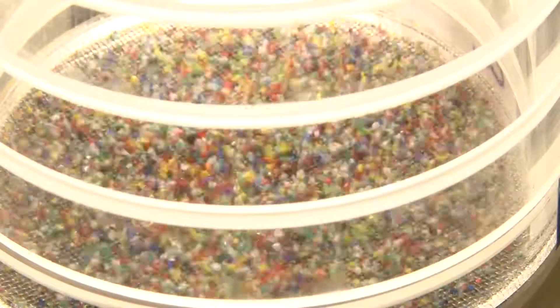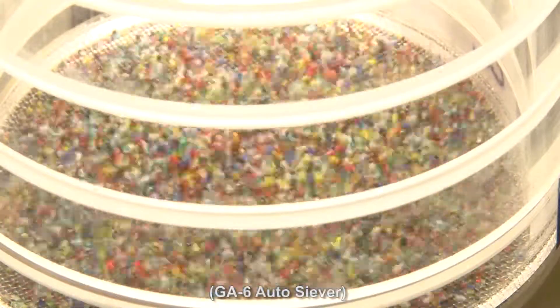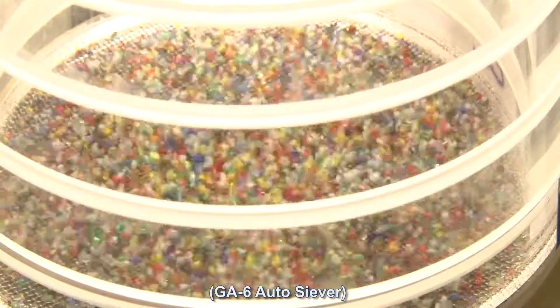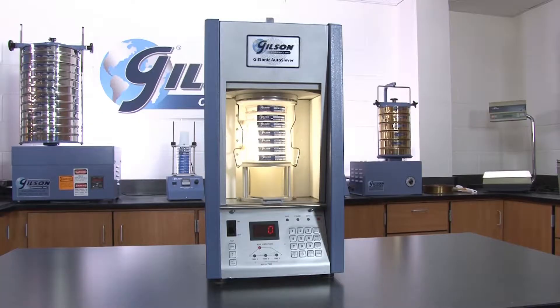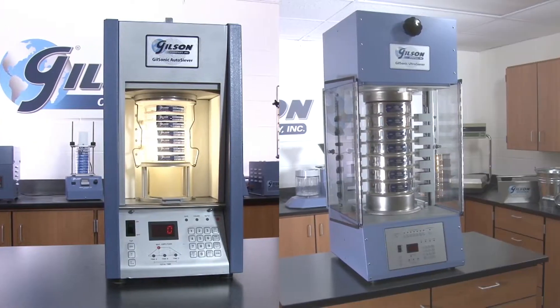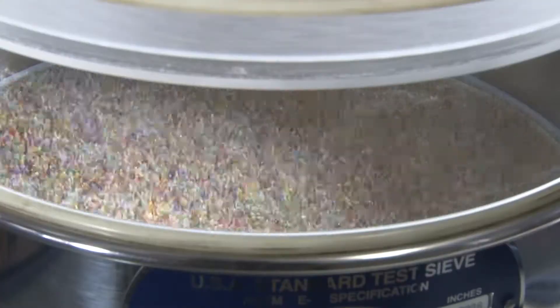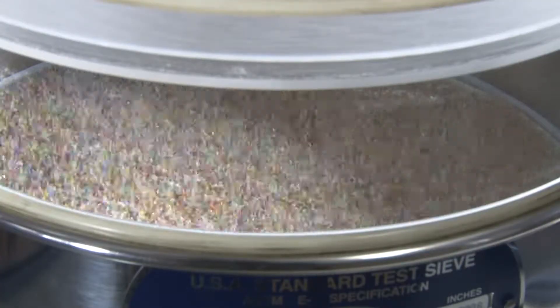SONIC sieve shakers use sonic energy pulses to create an oscillating air column through an enclosed sieve stack. And the Gilson GA6 Auto Siever and the GA8 Ultra Siever combine the latest in separation technology with digital control for fast, precise sizing of test samples.